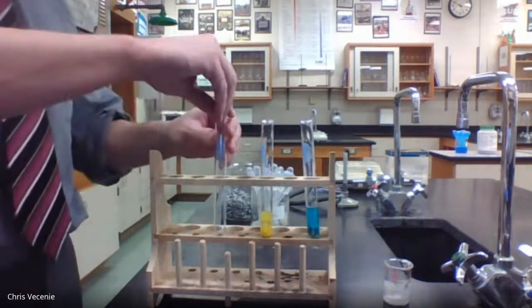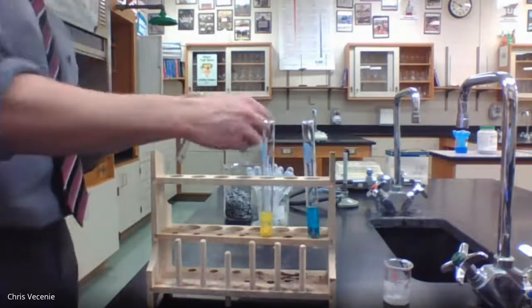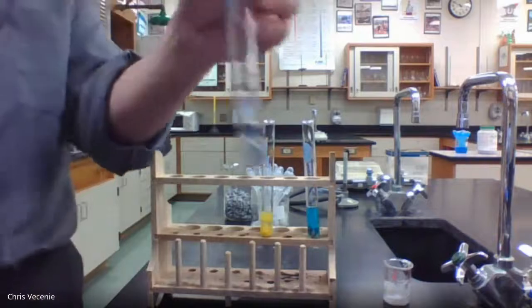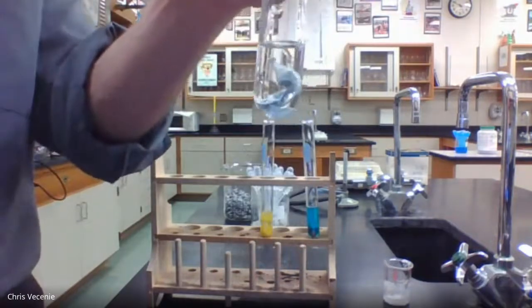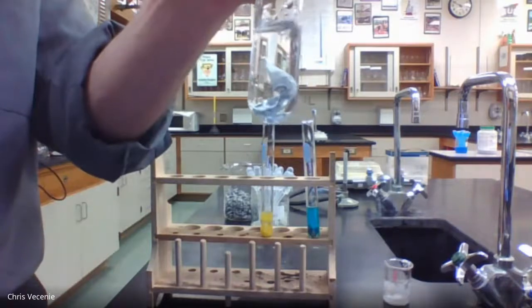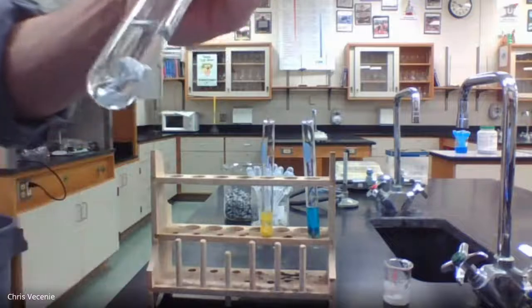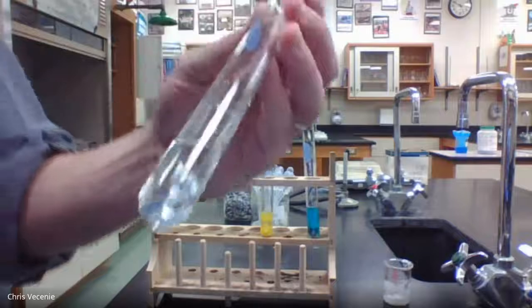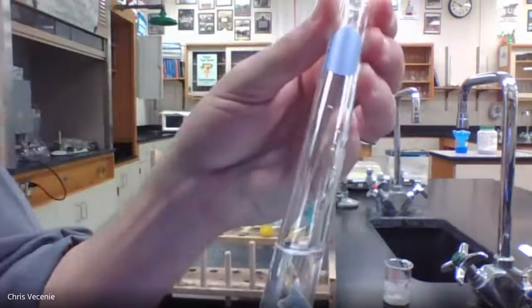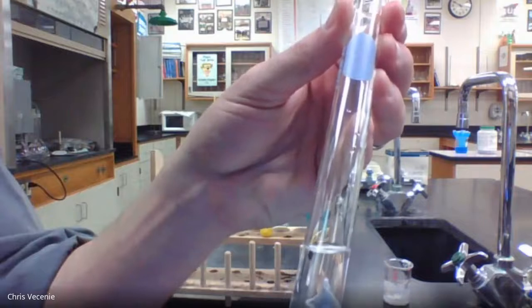So I'm going to drop this guy in here. And then I'm going to take a pipette of my hydrochloric acid and we're going to inject it. Like I said, we're going to give it a second to get going.